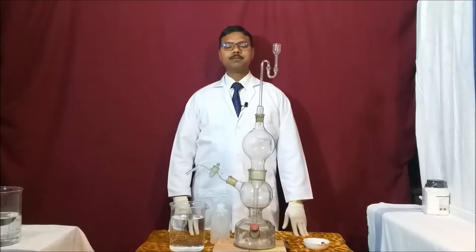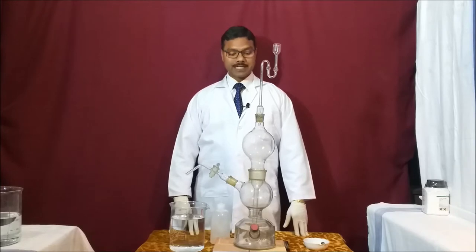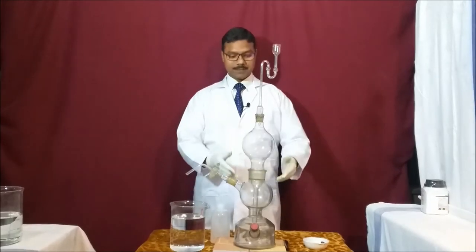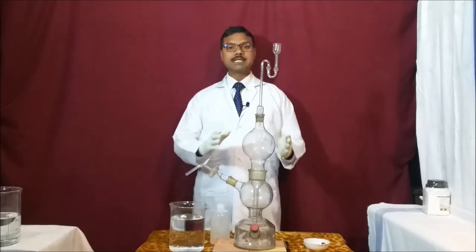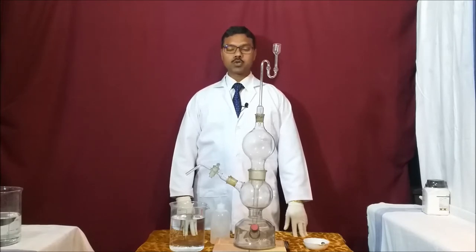Hello students, welcome to our YouTube channel Innovative Chemistry. Today I am ready with the experiment in which I am going to show you how Kipp's apparatus works. This apparatus was designed by scientist P.J. Kipp. With the help of this apparatus we can prepare gases such as hydrogen gas, carbon dioxide gas, and hydrogen sulfide gas.